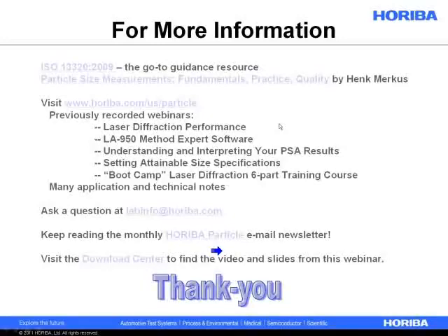Or you give diffraction a miss altogether and go to another technique that can measure at full concentrations, like acoustic spectroscopy. We do have an accessory we call the paste cell that, again, you don't need to dilute, but it's not really applicable for water and oil emulsions. Or I should say it's only really useful if the viscosity is high enough. I mean, there's a reason it's called the paste cell. The viscosity needs to be so high that it doesn't just leak out between the two optical glass plates that we use to create the cell.